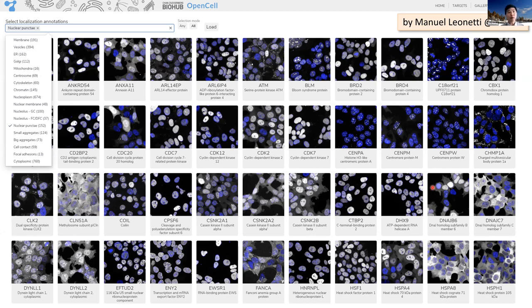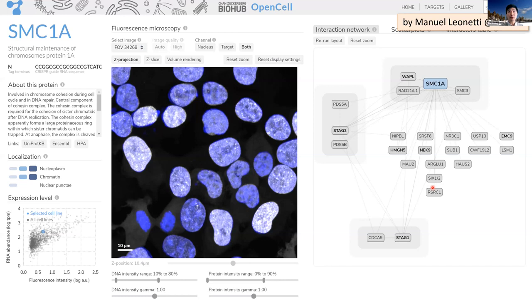In fact, proteins are either doing things that they're not expected to be doing, or having hugely unexpected cell-to-cell variability. For each of those proteins, Manu has the imaging data and the proteomics analysis of the interaction partners, showing here SMC1, one of the cohesin complex, and with the pull down using endogenously tagged protein, it's much cleaner compared to any overexpression case.